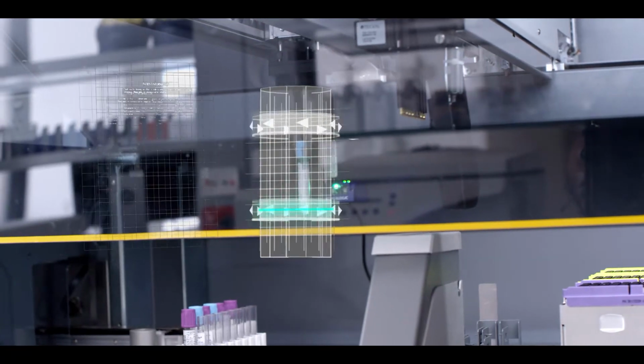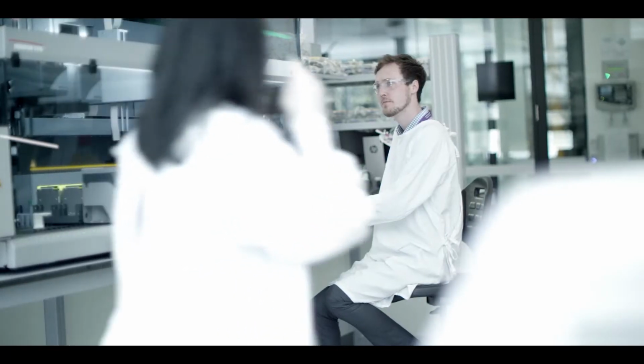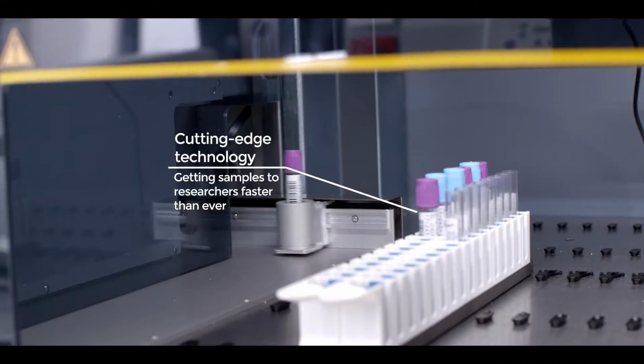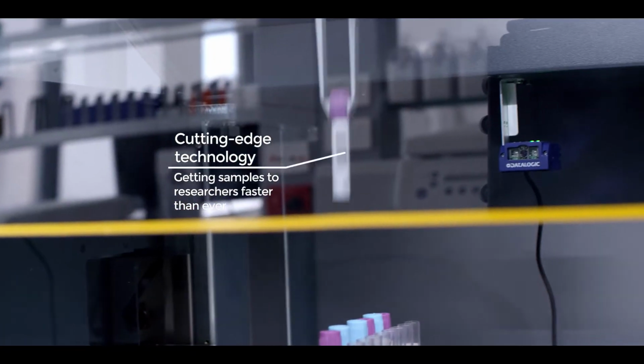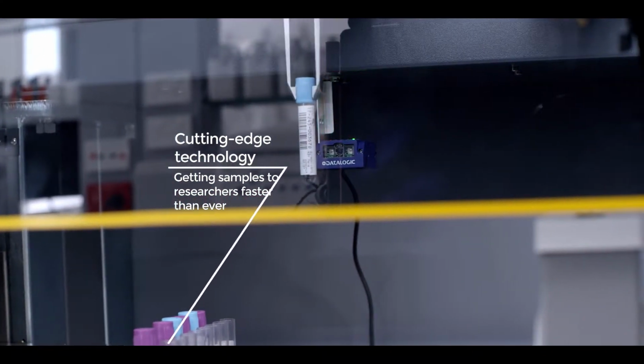This biobank allows us to pre-collect samples for researchers ready to go, so that it can expedite the completion of research, because collecting samples for individual researchers can be a very long and tedious process. But because of the way we're set up and we're linked through New South Wales Health across the state and through all the pathology laboratories, we've got access to lots and lots of really valuable specimens for research that we can collect and make available to researchers very quickly.